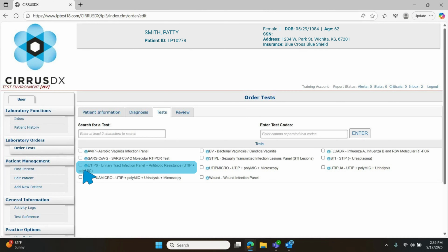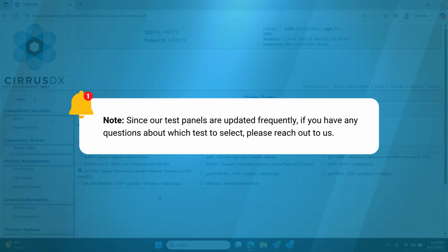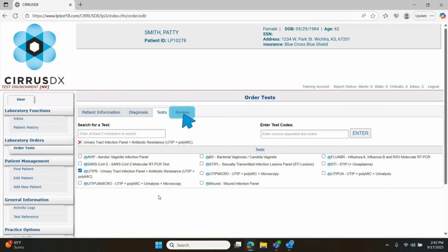Next, choose the specific test you want to order from the available list. Please select only one test per order, as selecting multiple tests can cause issues. Since our test panels are updated frequently, if you have any questions about which test to select, please reach out to us. Select the Review tab to review your selection.